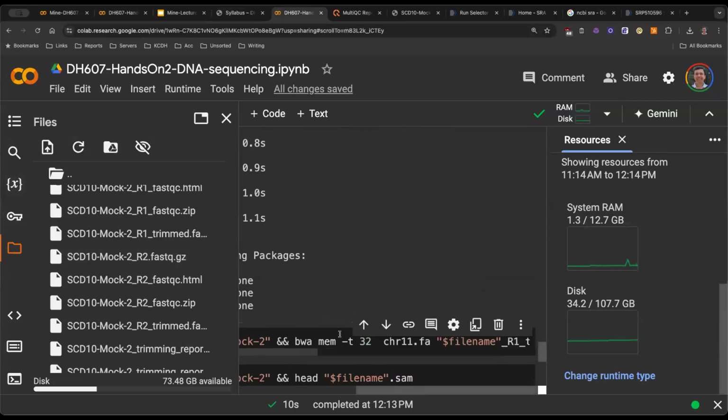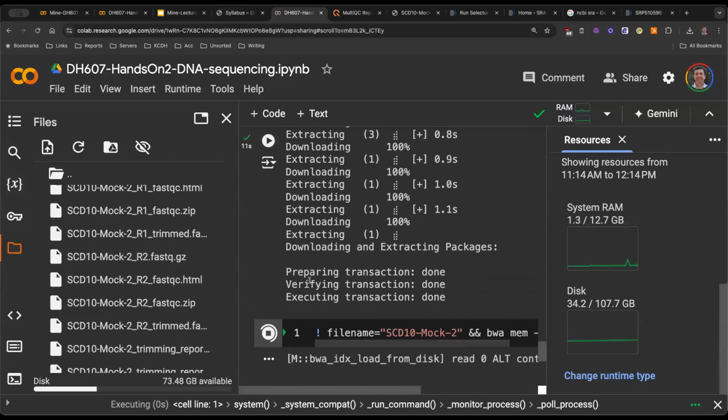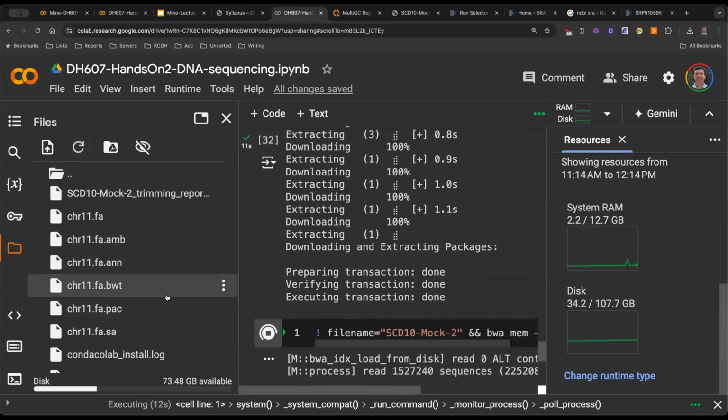Okay. So my SAMtools is done. Keep tracking the memory. Now we are doing the magic step, the alignment step. Using the BWT transform that we had, one thing you can figure out is what that tool did: you only downloaded chromosome 11.fa, but the indexing step created these different files for you. BWT is your BW transform. ANN is an internal structure that BWA uses for storing where exactly to begin storing these indexes and so on.